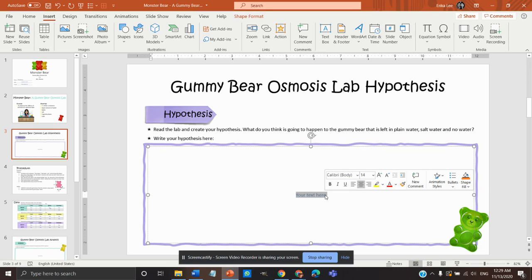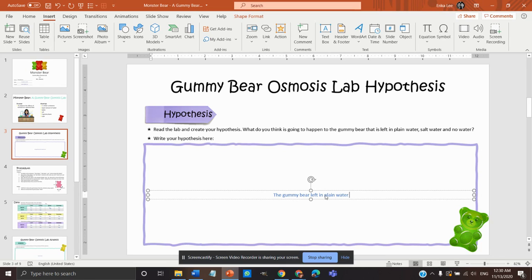And then I'm going to write, I don't know, anything like: the gummy bear left in plain water will swell.